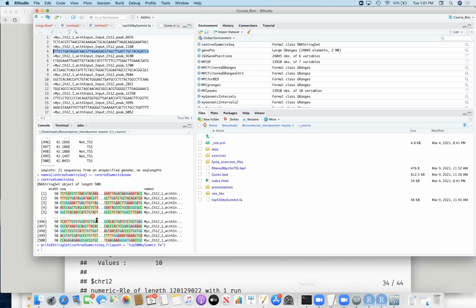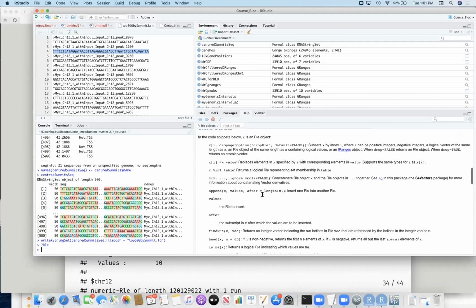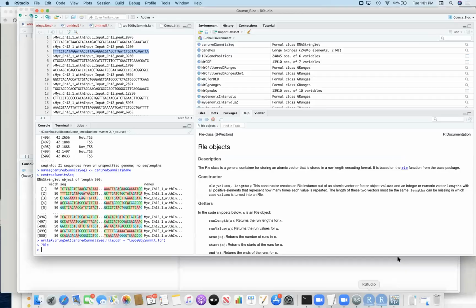I wonder if I actually, RLE. Okay. Sorry, I'm just going to pull up a help page at this point. I'm going to share my screen in a slightly different way.